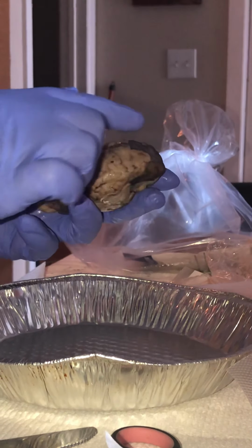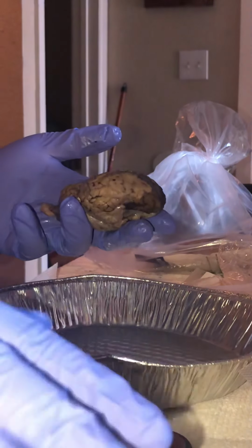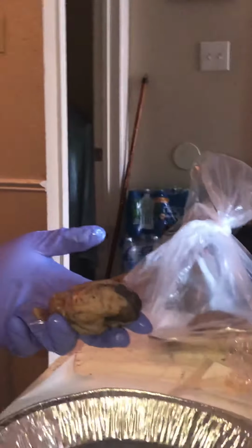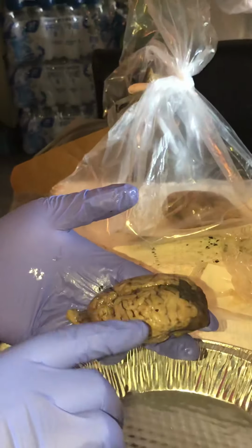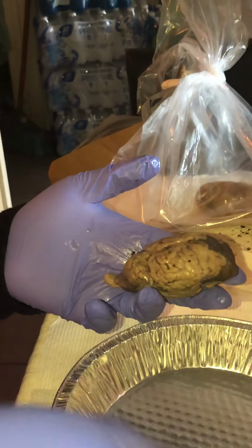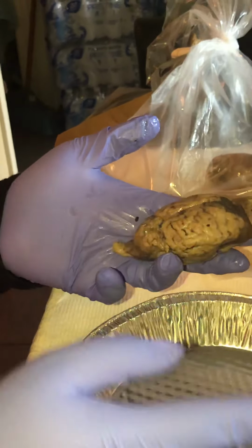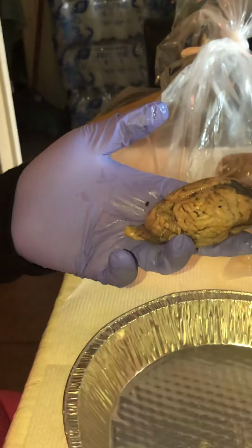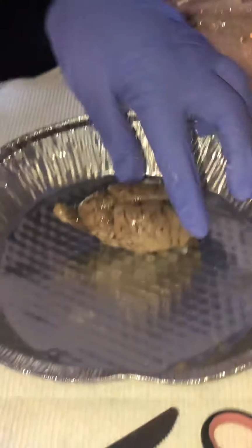Also, let's talk about the longitudinal fissure. Okay, so the longitudinal fissure is right here. With the longitudinal fissure, we're going to go ahead and cut this thing down, all right?